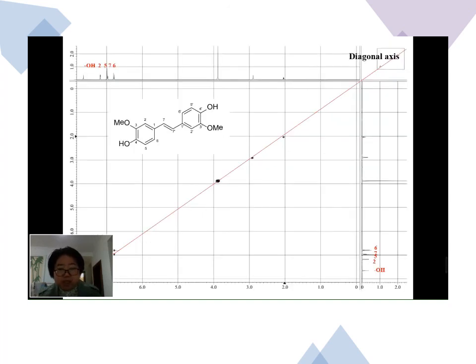A one-dimensional spectrum determined by the frequency axis of chemical shift has been converted into a two-dimensional spectrum in which two frequency axes correspond to chemical shift, and different protons have signals at their respective frequency peaks. It's not difficult to imagine that in the frequency domain, the signal peaks of the two-dimensional spectrum appear on the diagonal of the square.